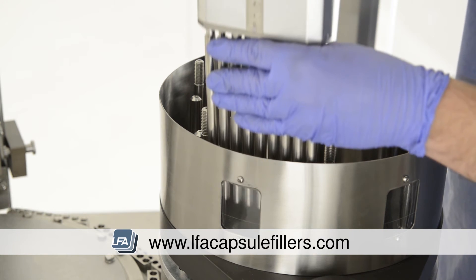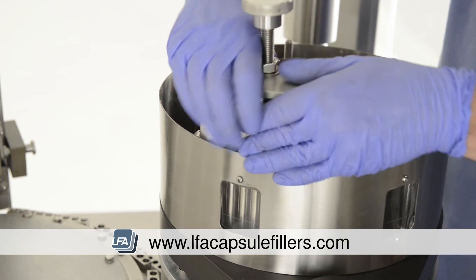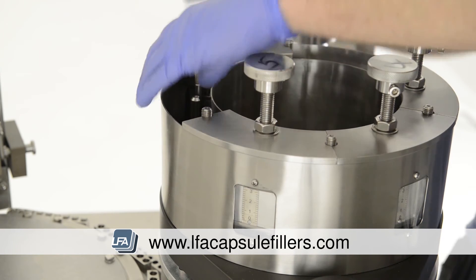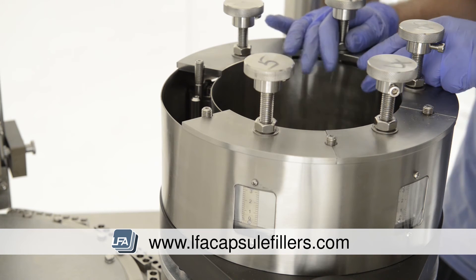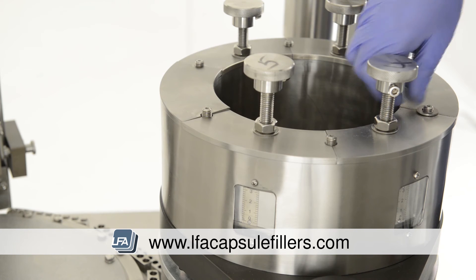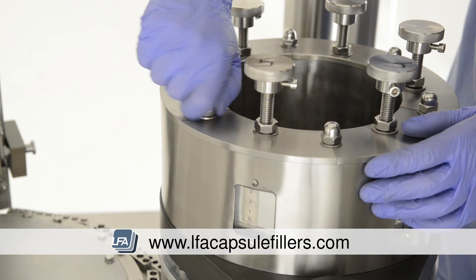Now we're replacing the tamping tools into the positions they were originally removed from. Whilst doing this, we need to ensure we're being careful with the tips of the tamping tools as they're fragile. Now we need to replace the washers and nuts on the very top section to secure the tamping tools into place. Tighten the 17mm nuts on top equally in small increments.